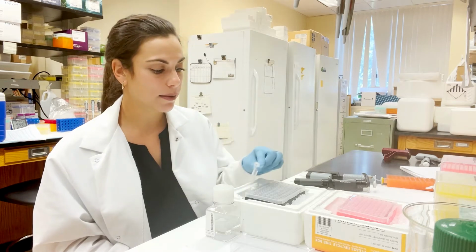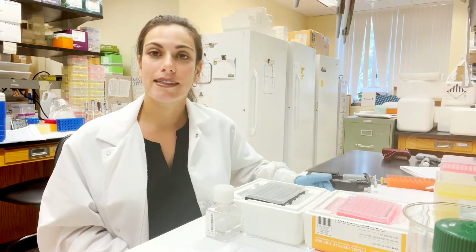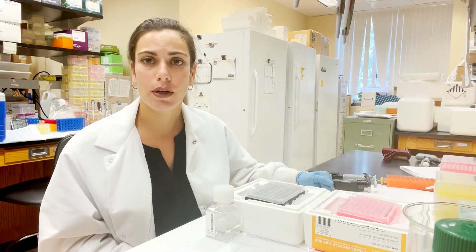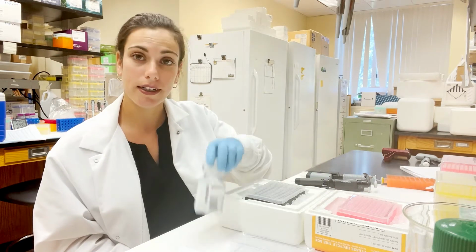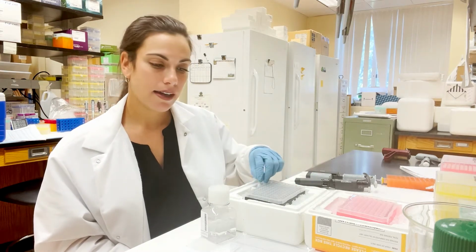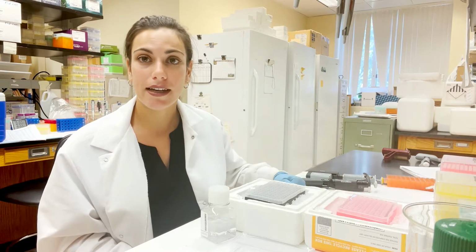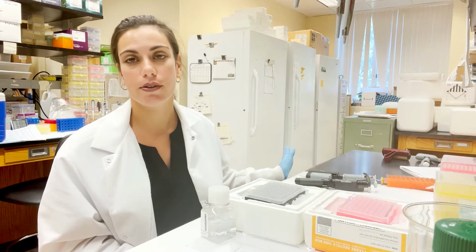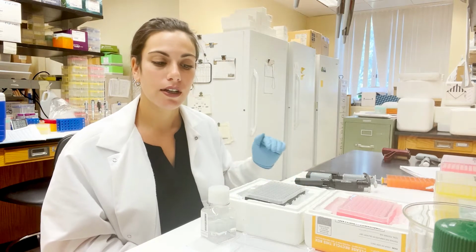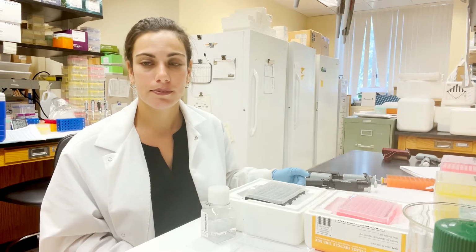Now what goes into our master mix is adapted to our concentration of DNA. Since I concentrated my DNA down to 50 nanograms per microliter, I will be adding 22.2 microliters of nuclease-free water, 3.0 microliters of 10x NEBuffer 4, 0.4 microliters of each enzyme, which we keep stored in the freezer, so that way we keep them at really cold temperatures the whole time. And then we add 200 nanograms of genomic DNA, which in my case is 4 microliters.